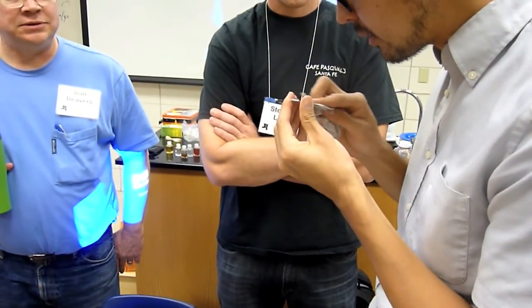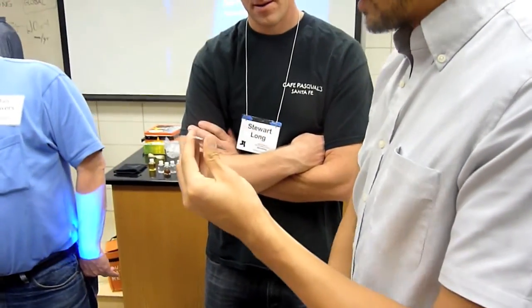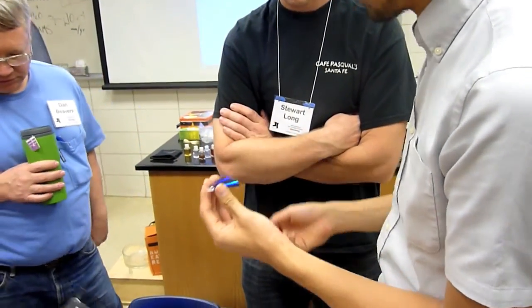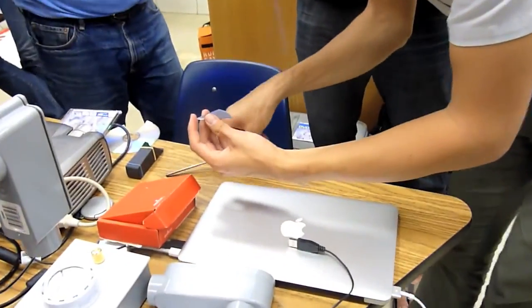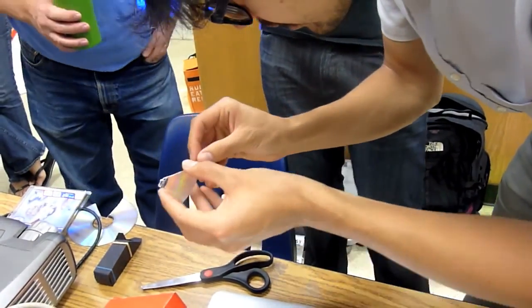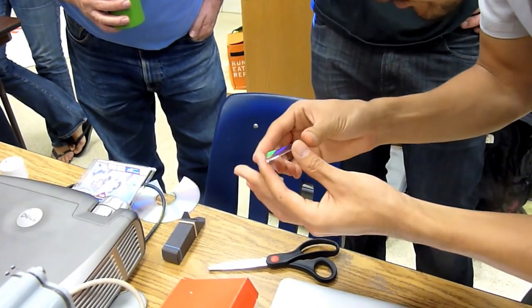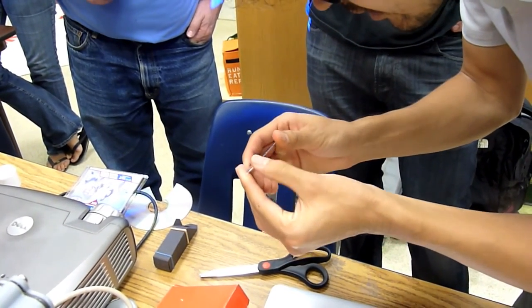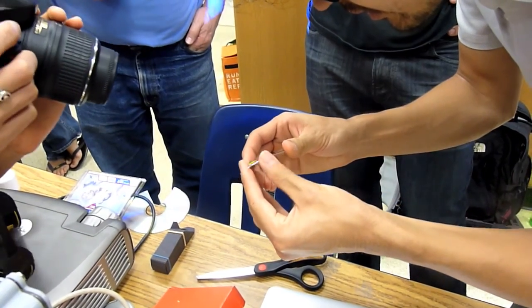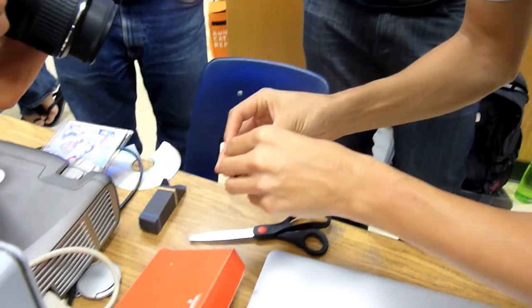It just tells you presence, it's not quantitative. Right, so often a lot of it will be damaged when you're cutting it. Yeah, I noticed, that's why I wanted to watch you do it. So what I do is I take this, and then you usually can find a little edge near the outside. And sometimes it's like a can of ice cubes. Right, gotcha. There you go.